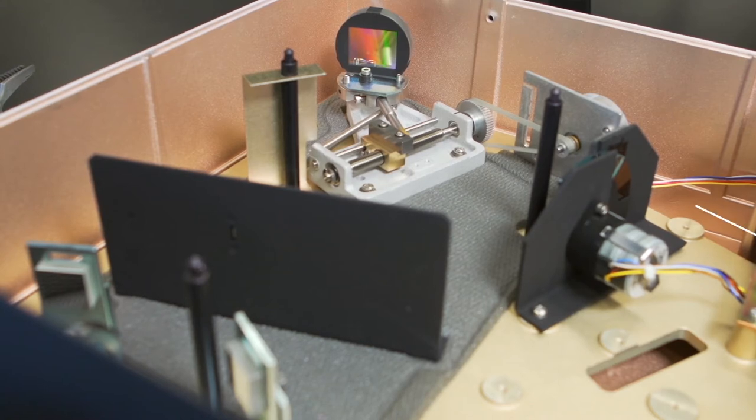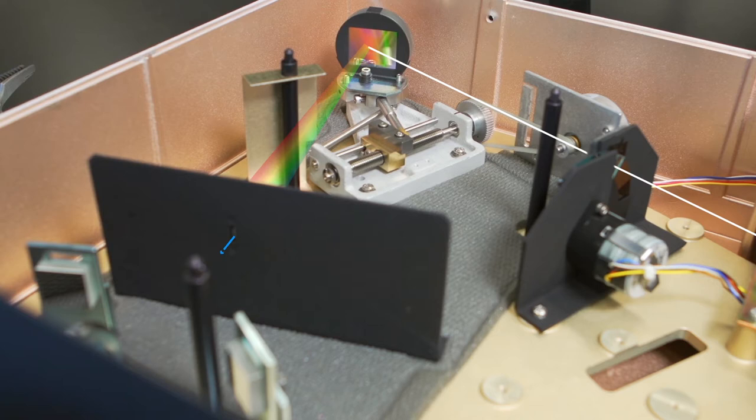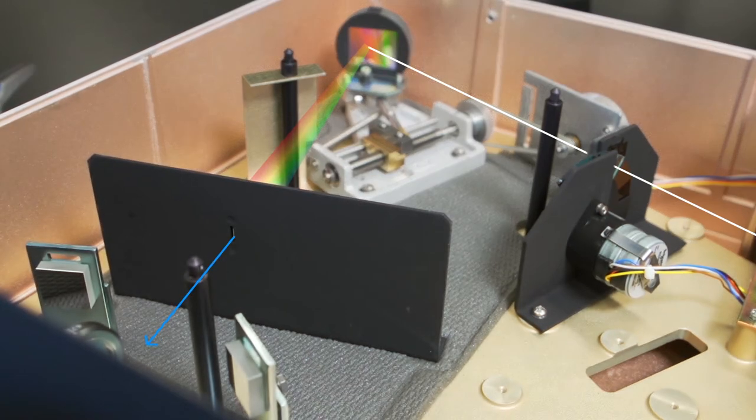The light travels towards the grating and strikes it, causing the light to be dispersed into a spectrum of colors. The grating is where a specific wavelength is focused onto the exit slit, thus selecting for a particular wavelength.